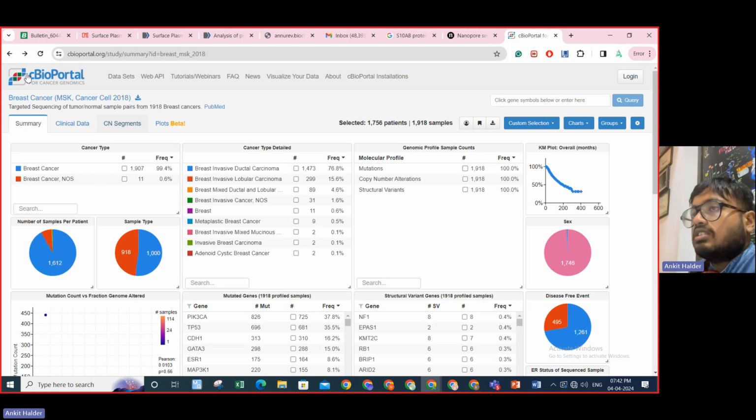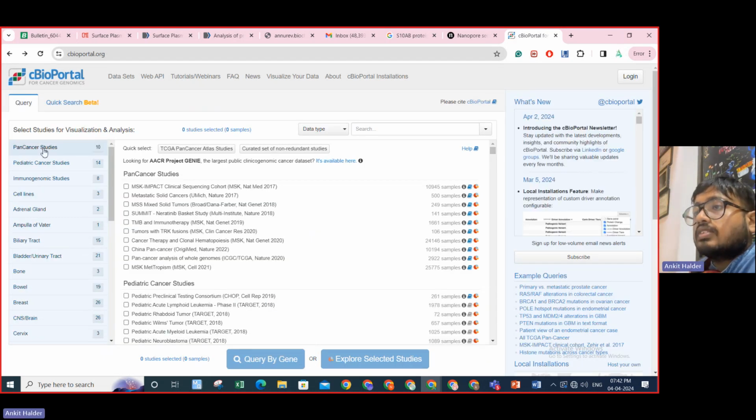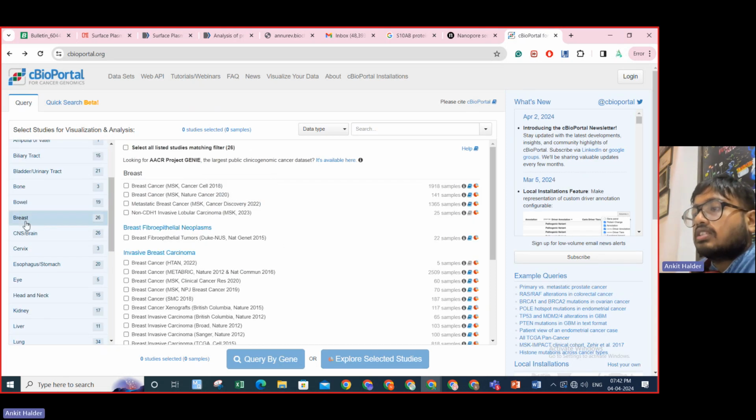What you can do is go for this and query by gene.